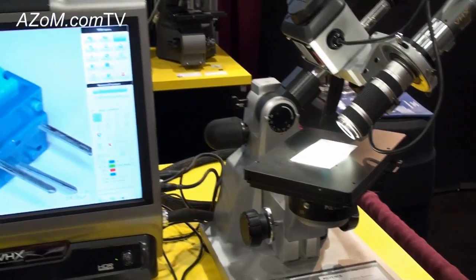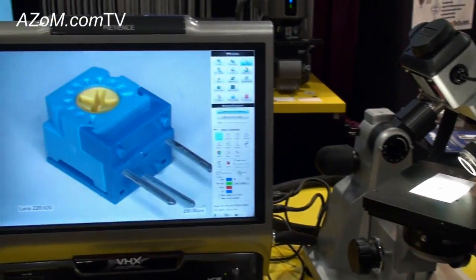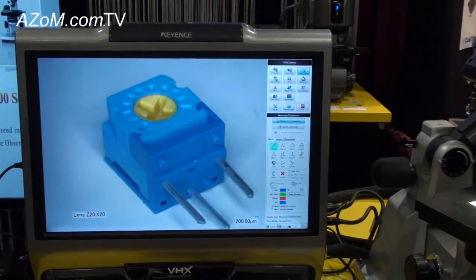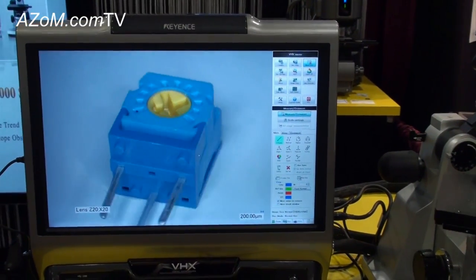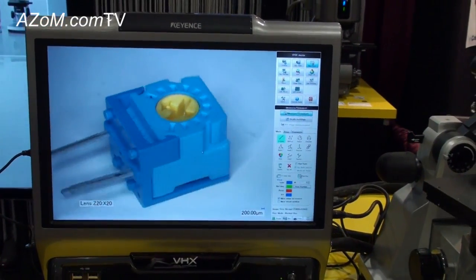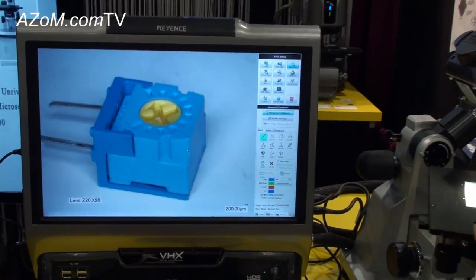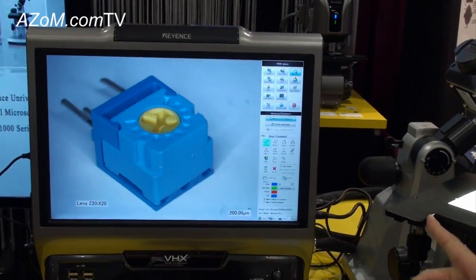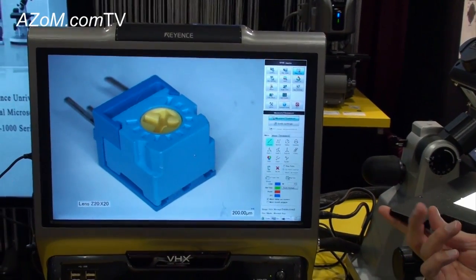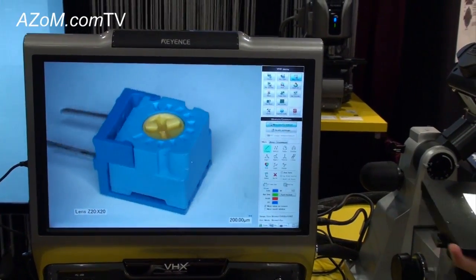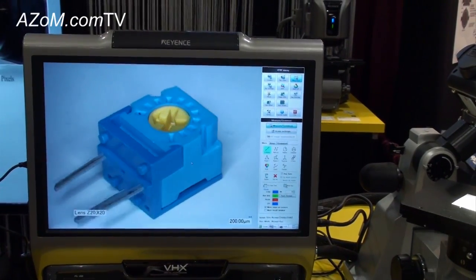You'll notice that this part is completely in focus, and we can rotate 360 degrees around the target and get a unique perspective of the sample without actually having to manipulate the sample itself.